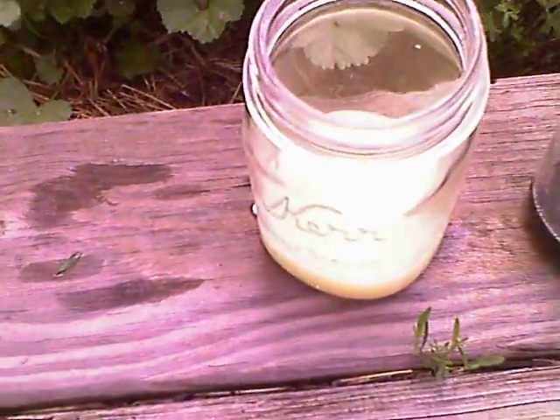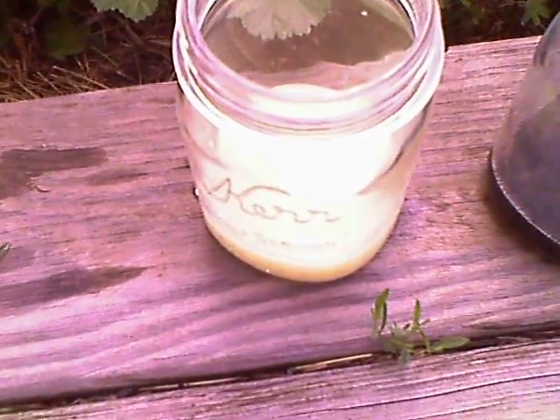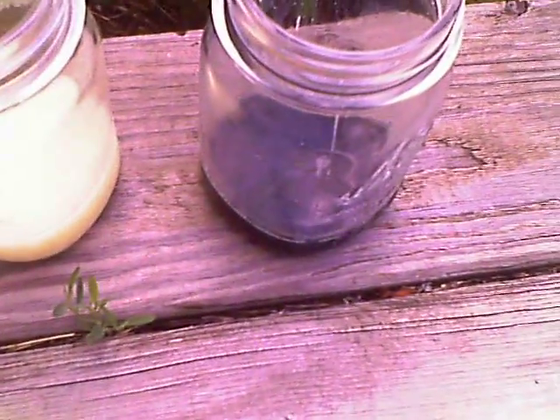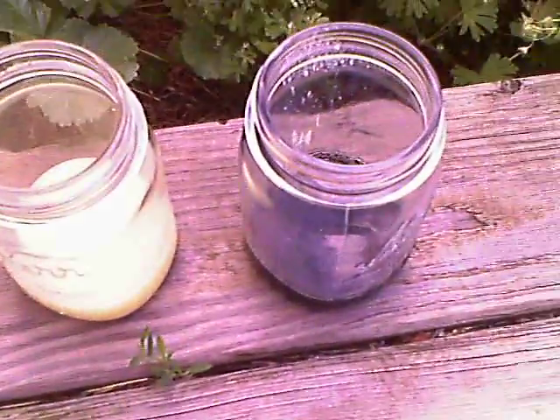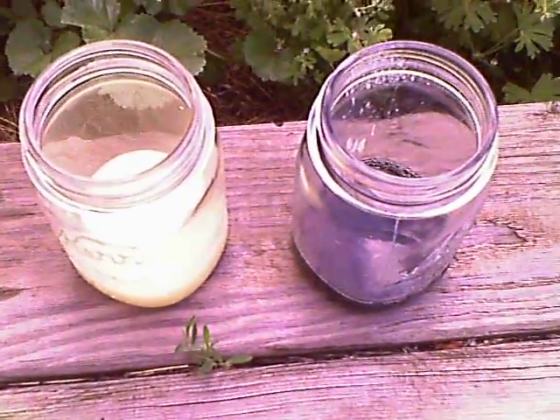This is 100 milliliters of lemon juice, which contains citric acid. Here's 100 milliliters of chlorophyll solution that I made, but there's lots of videos out there, so you'll find out how to make it very easily.